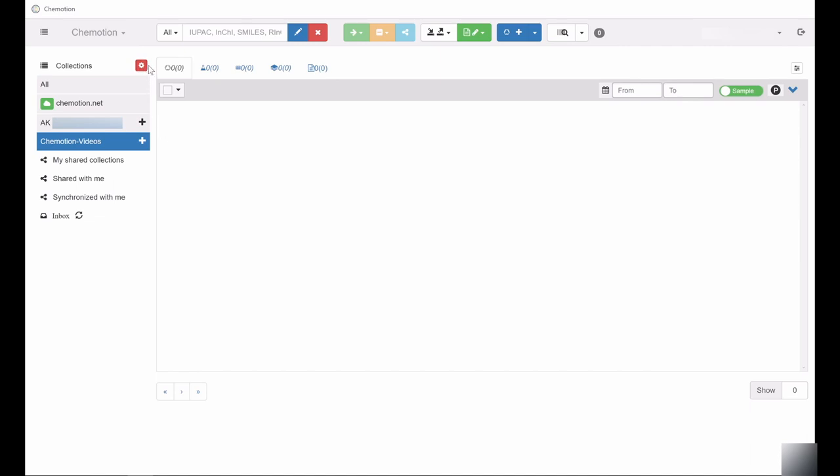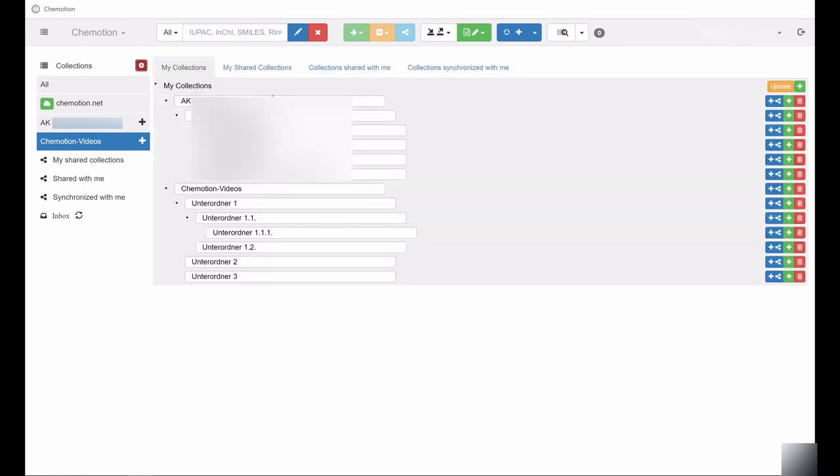This will open the corresponding menu to edit collections. Here you can create subfolders, or more precisely, subcollections, for each collection.